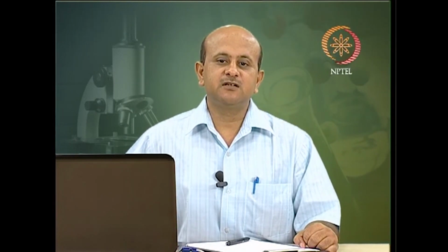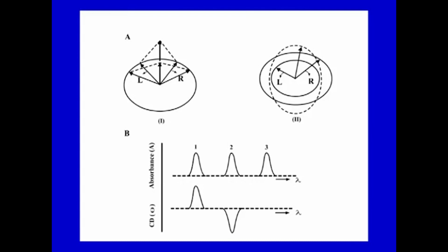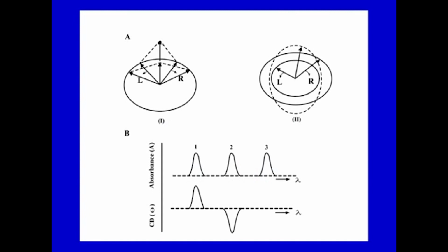If you see here, if both components are equivalent, then there is plane polarized light, otherwise there is elliptical. If the two components are not the same, or are of different magnitude, then there will be elliptically polarized light, as seen in here.